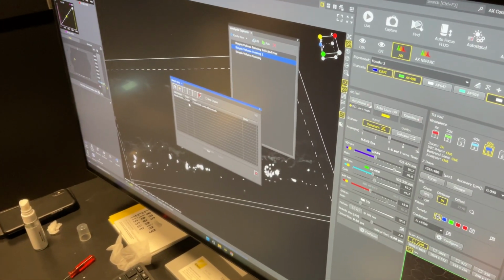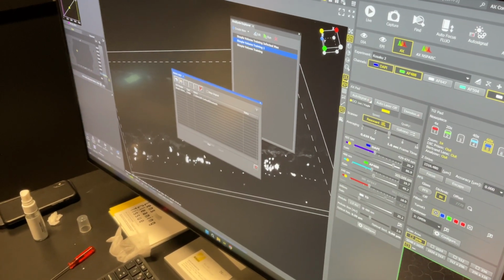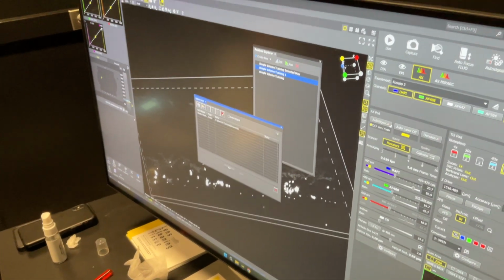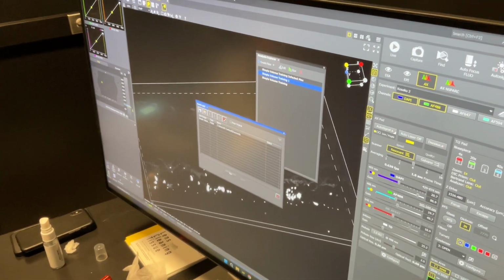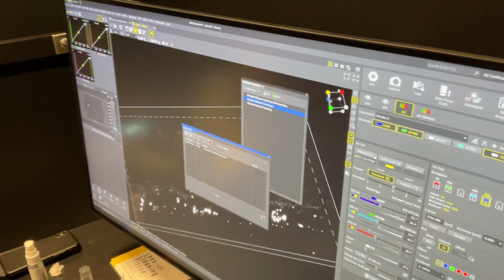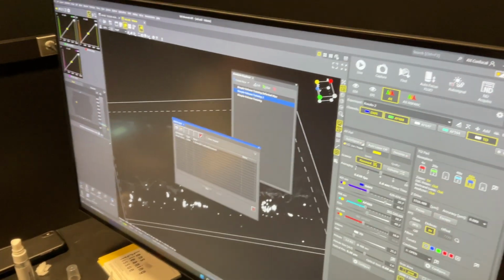Then you can queue up completely different analyses, and somebody at the end of the day could hit run. Rather than running that during the day when people want to be imaging, you can set it up to go overnight or over the weekend. It just depends on how much data you have.